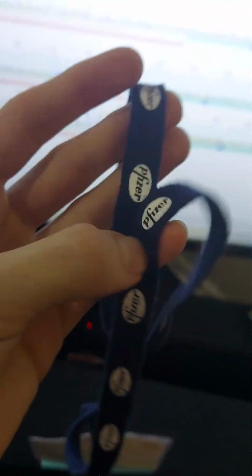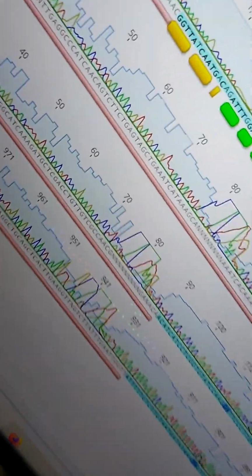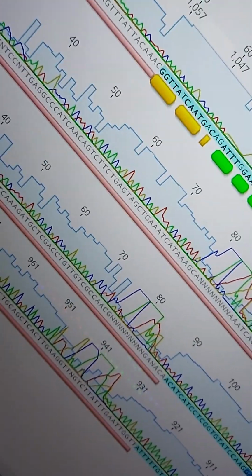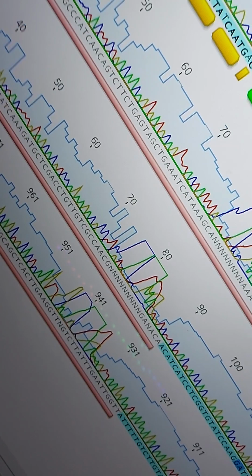And the way that we have created it is simply by measuring the genome of the SARS-CoV-2 virus and measuring the human genome using this exact same software.